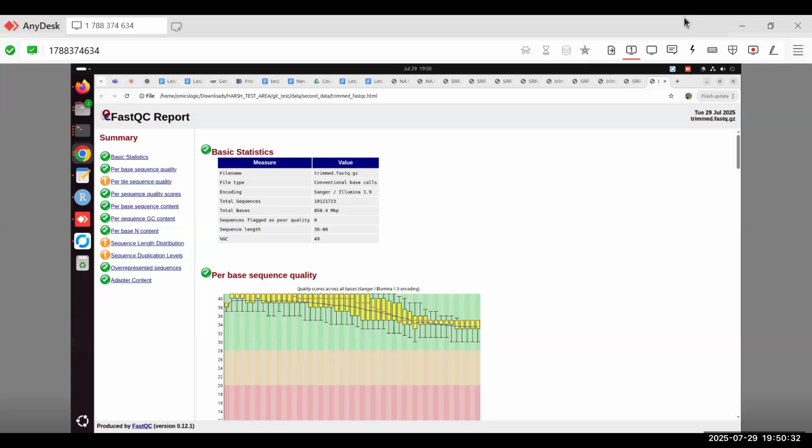If you have seen in a few papers, the log fold change, some use one. That is my query. What are the acceptable values, and how can we get those significant genes, the expression levels?